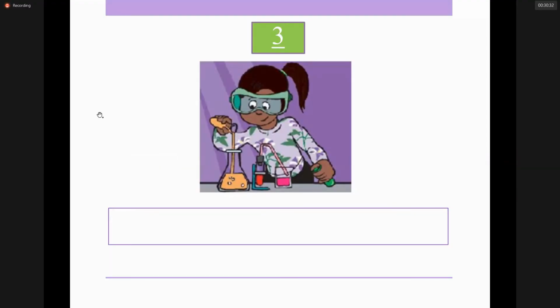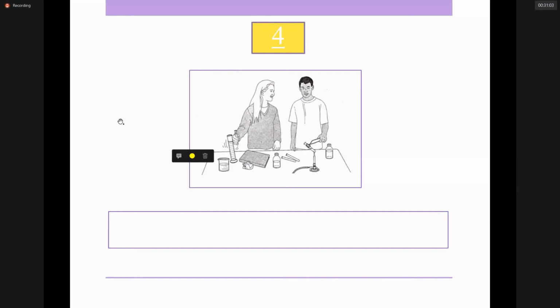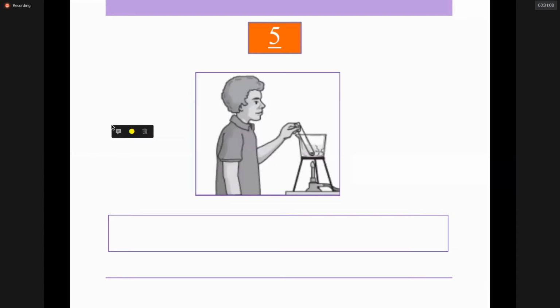Okay, third tube. Not safe, but she is not wearing gloves. Yes, and she's not wearing a lab coat. صحيح سكينة، كوثر، جود, not wearing the lab coat. Or she handled the tube directly without gloves, and just only the goggles. ممتاز. She's not focusing. Yes, she's not focusing. ممتاز.